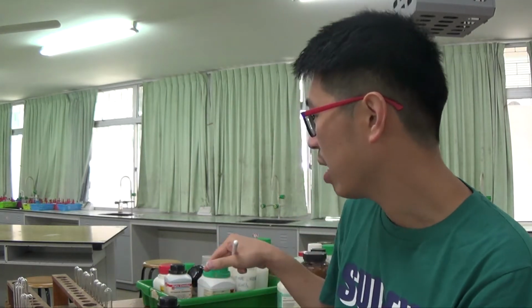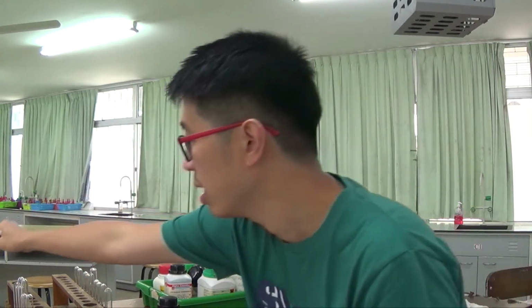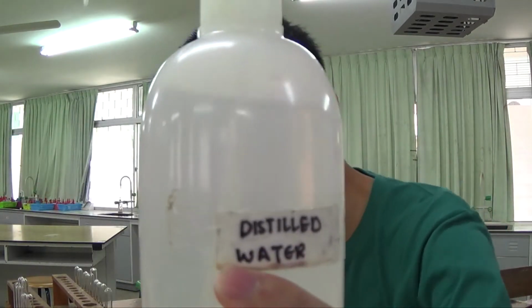For most of my stuff today, I'm just scooping out a bit of solid from the bottle itself, so I'm not being given it as a solution like what you would have in a real exam. So we would use distilled water or deionized water, because they contain no dissolved ions that can interfere with our qualitative analysis. The objective for qualitative analysis is to identify what cations and anions are present. If you use tap water that contains dissolved ions, they will interfere with your results.